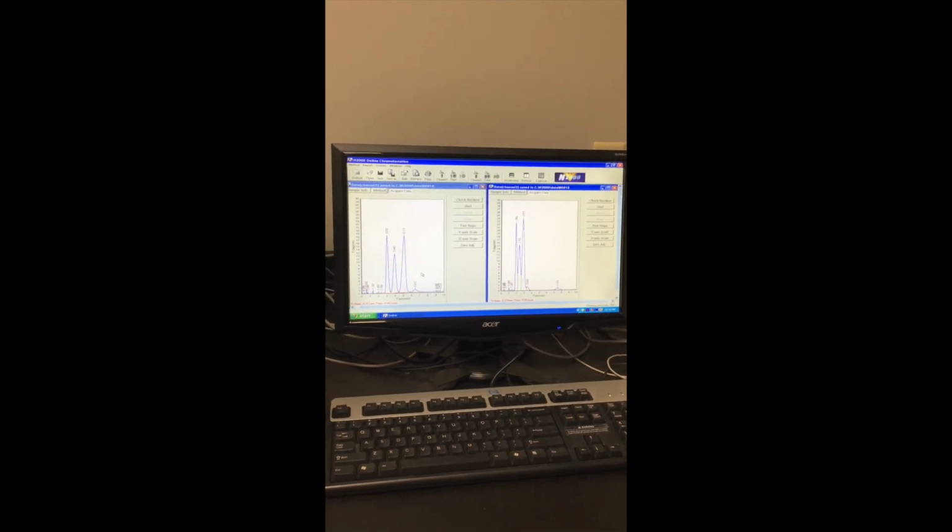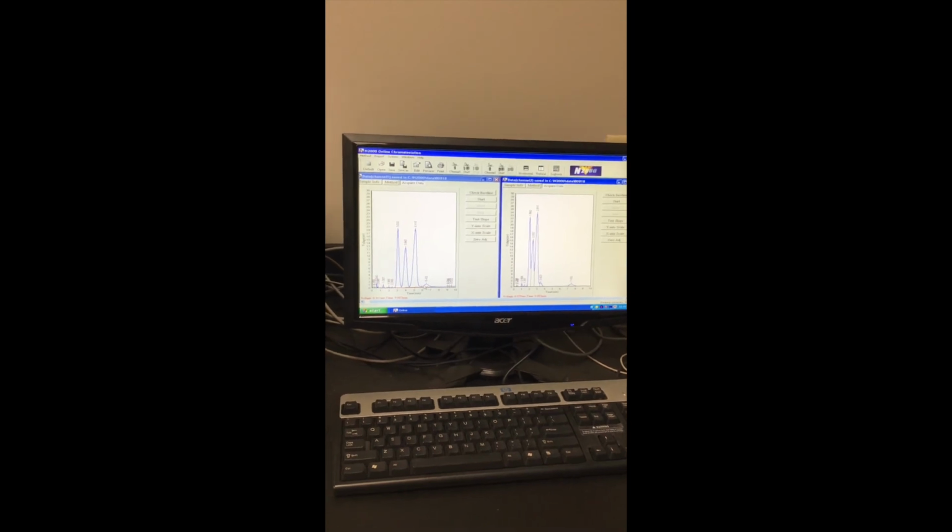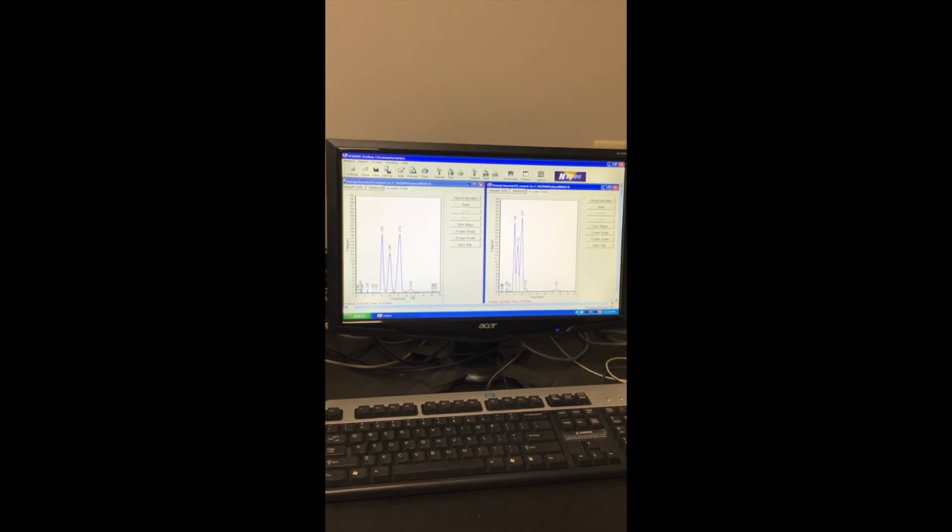Now the problem with this is over here, the same thing was run, or at least I believe that this is the same thing. It'd be something similar. Notice that the timing is different. This over here says 6.4 minutes. Well, this is a consequence of the particular settings that were used for this GC on the left versus the one on the right, so nothing is perfect.